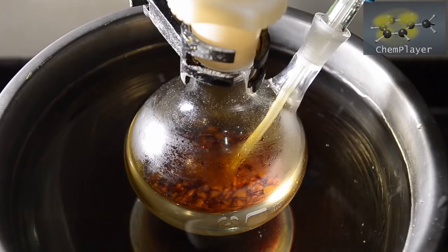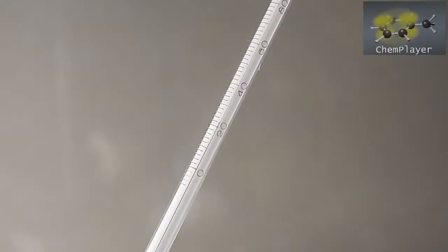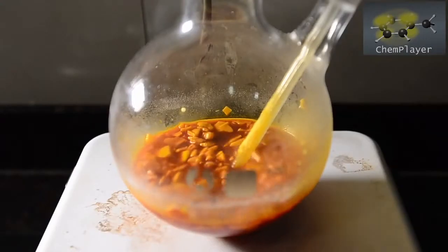Here we are with all the sodium propionate added. It's a little difficult to stir, but the stir bar is just managing. Temperature after complete addition is about 25 degrees C. We took away the cooling bath and then stirred the mixture a bit more vigorously for about 10 minutes.